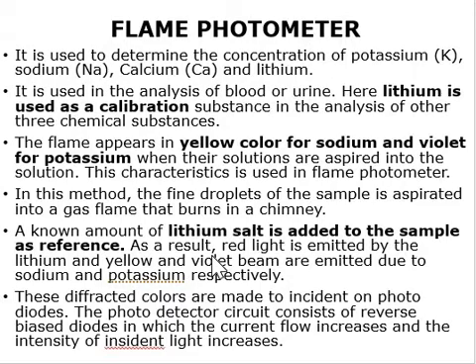And the amount of color decides the amount of conduction. If there is more color, then the diode will be entirely resistance free, and if there is very little, then proportionally to that light, it will do its conduction. Okay, right.